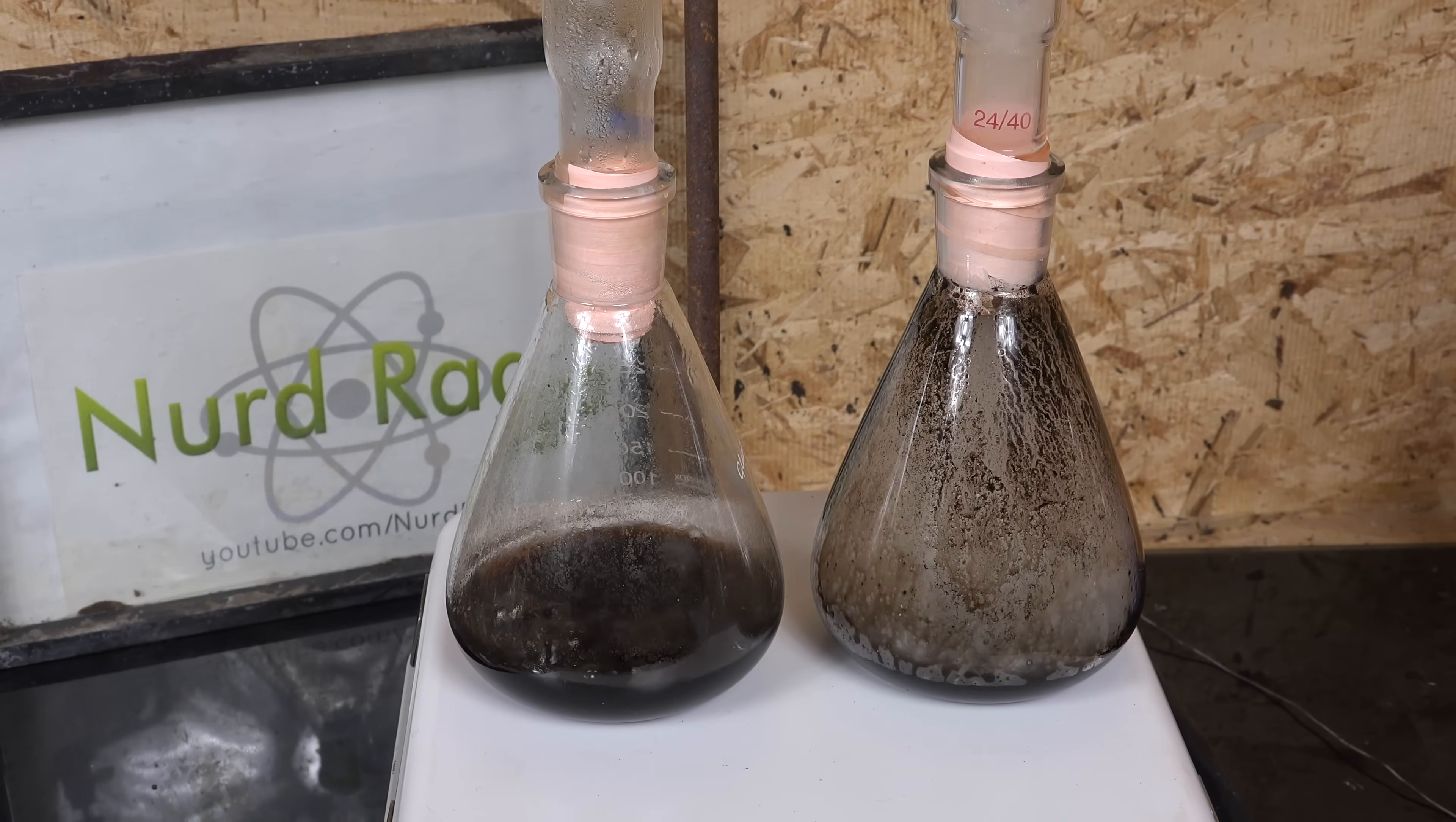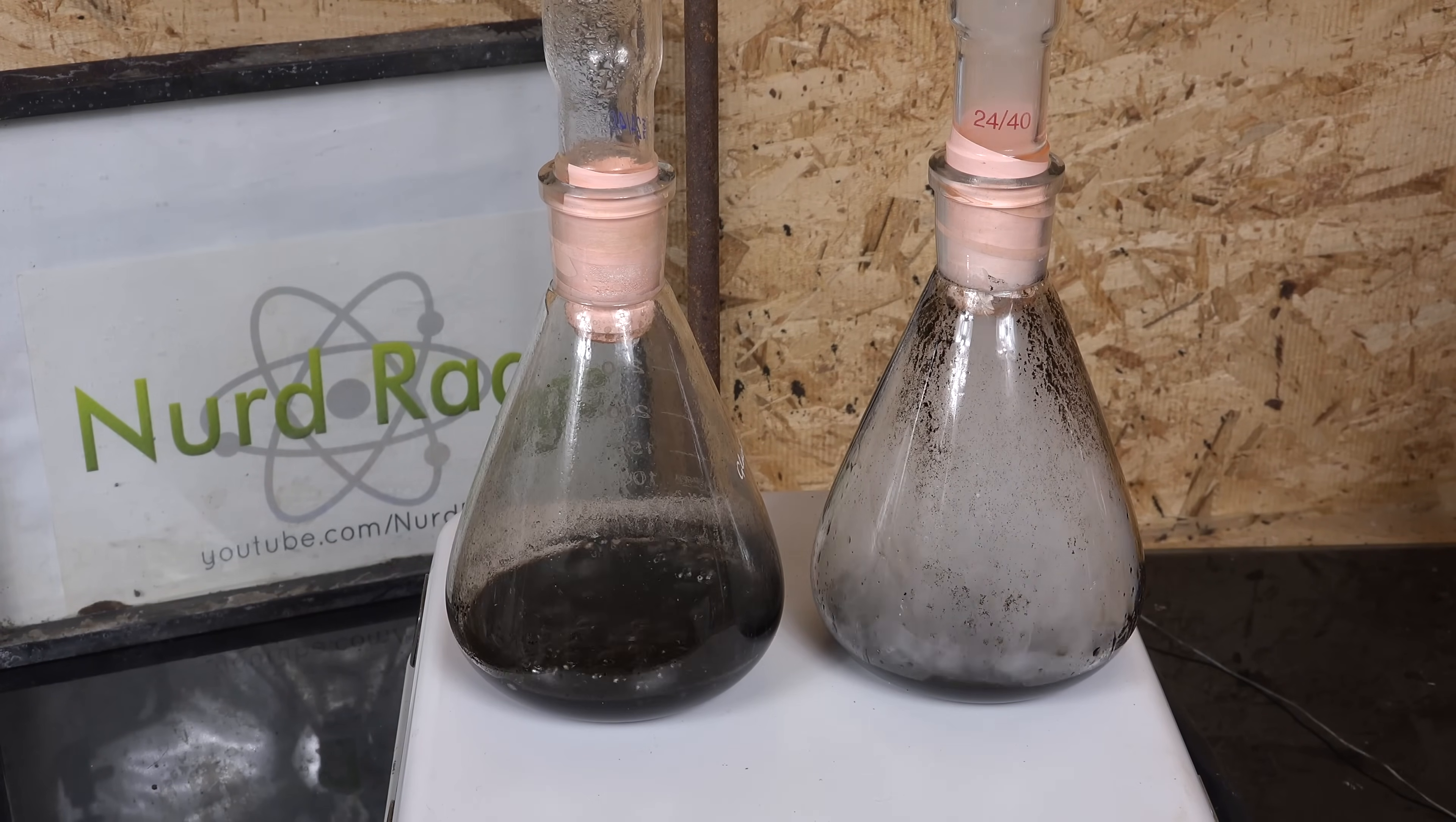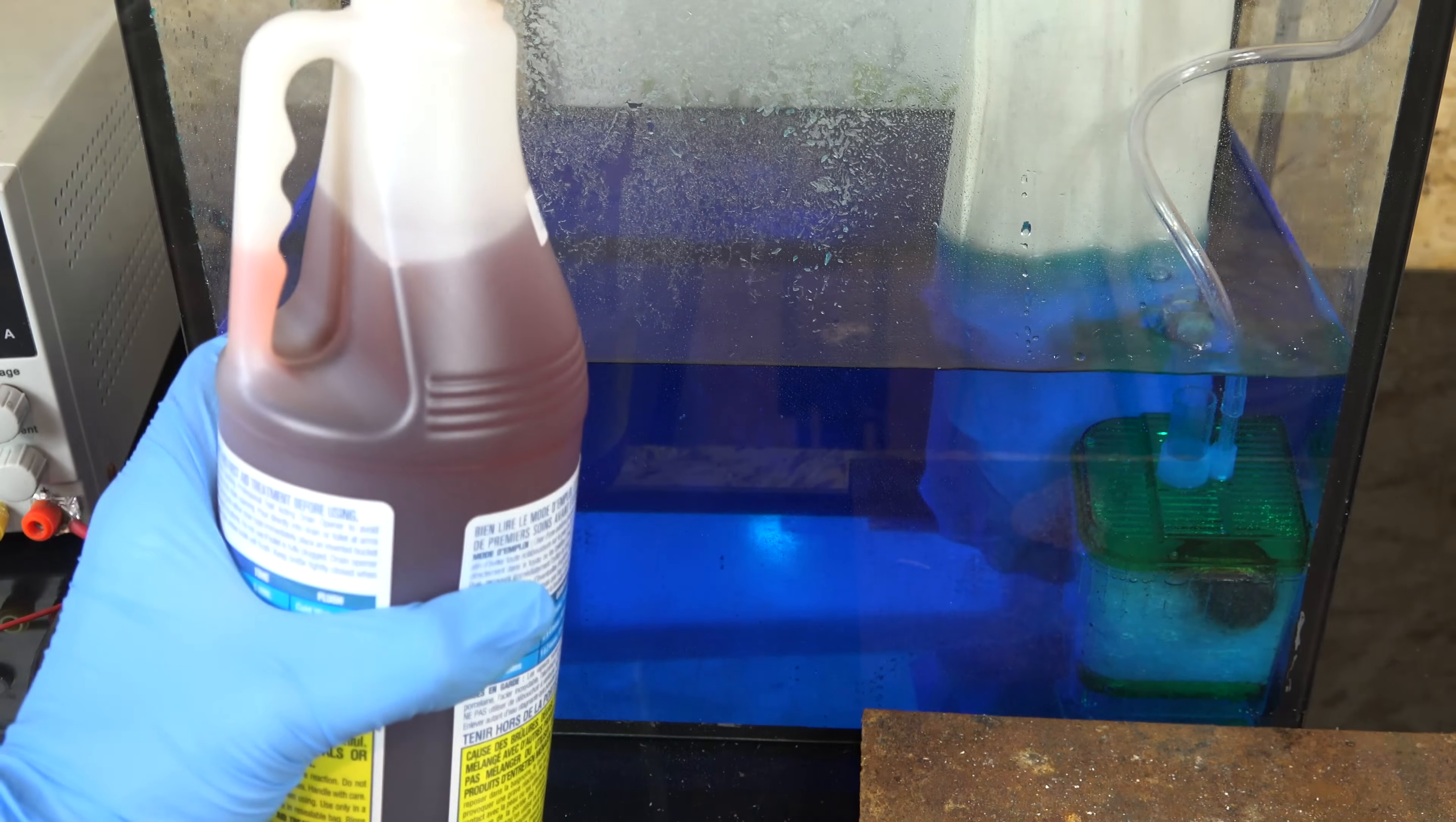It's also quite dangerous in pure form capable of burning flesh. It's infamous for being used in terrible acid attacks. However, like any powerful tool, there are good purposes as well and that's why we want to acquire some. I intend to use it for analytical chemistry. But because sulfuric acid is restrictive and hard to get in some countries, we have to purify it ourselves from lower grade sources.